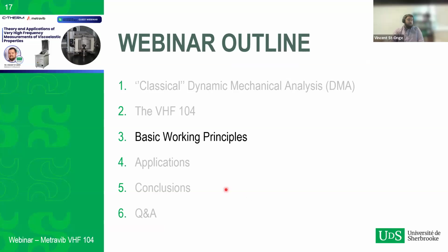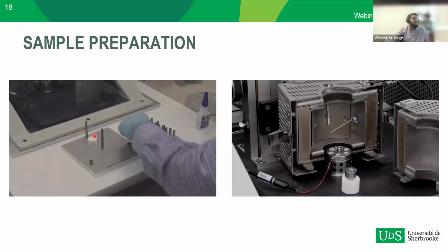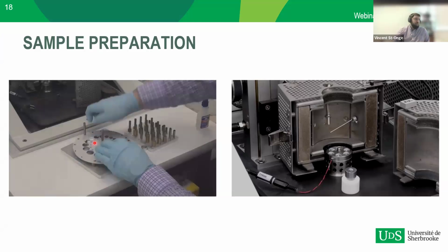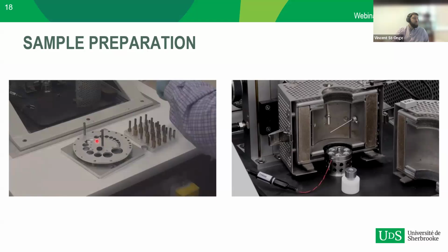So if we move on to how the instrument actually works, the first step in knowing how the instrument works is knowing how the sample is being prepared. So I've taken 2 little videos to show you how the sample assembly is being made, because it's very different from the classical DMA. If you look to the video on the left, you have access to a gluing toolkit. Basically here, the white part that you see is the part that we're going to be screwing to the shaker of the instrument. And everything else that you see at the moment is accessories simply to align where you're going to be gluing the sample.